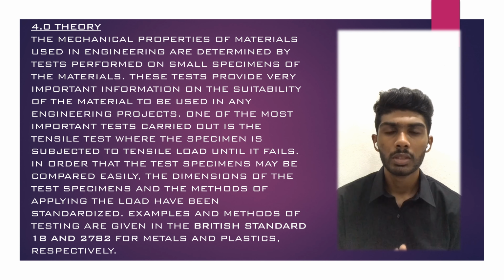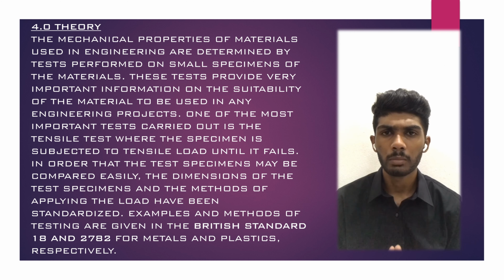Now let's have a look at the theory behind this experiment. The mechanical properties of a material used in engineering are determined by tests performed on small specimens of the materials. These tests provide very important information on the suitability of the materials to be used in an engineering project. One of the most important tests performed is the tensile test, where the specimen is subjected to tensile load until it fails.